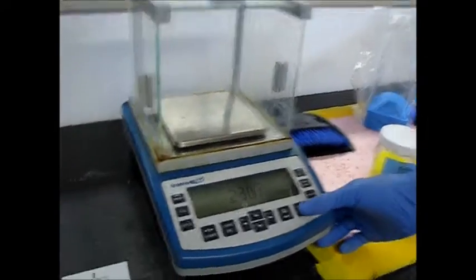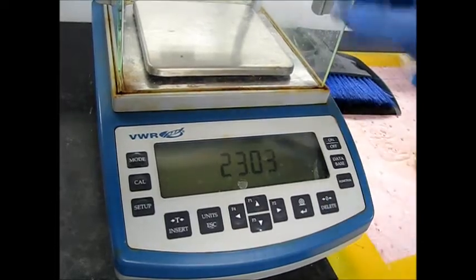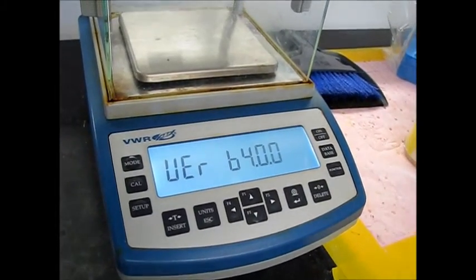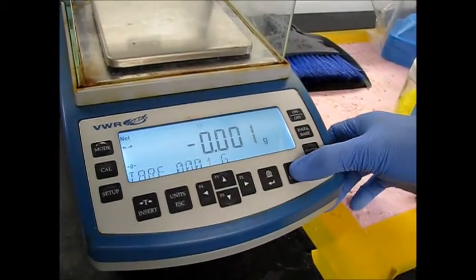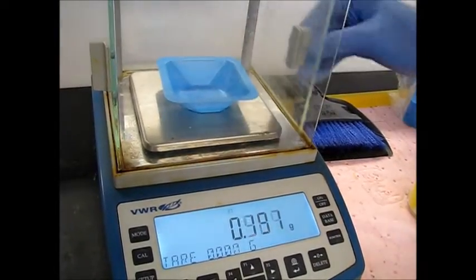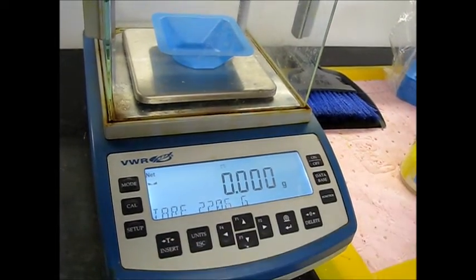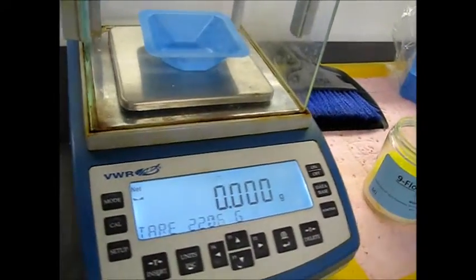It's important, first we have to zero the scale. I'm going to turn it back on. Oh, there it goes. All right, so we're going to zero it out. Put our weight in there. And now we're going to tare. And then we're going to add 0.2 grams of the 9-fluorenone, or 200 milligrams.